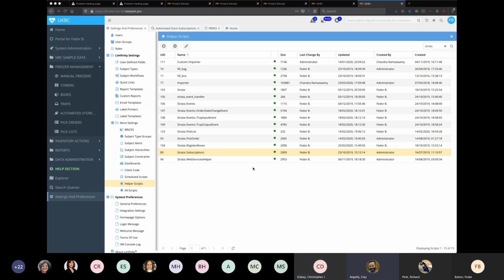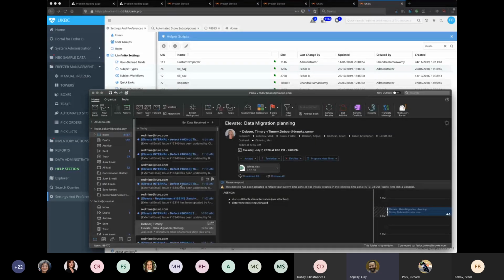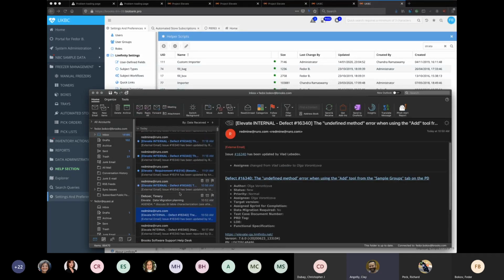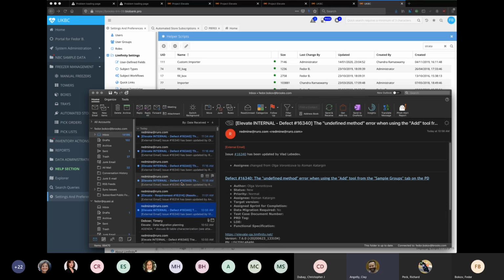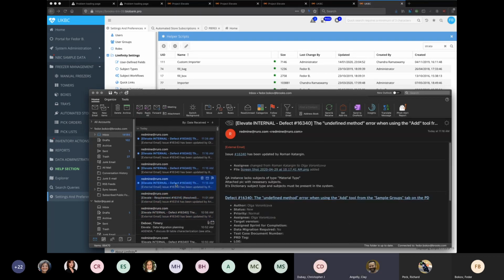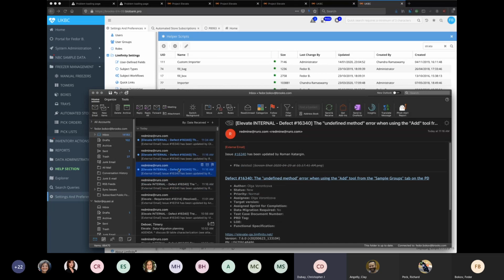Chris, sorry, this is Clay Angeli. A question to your question about whether we have plans to include Limfinity within a store. Could you elaborate a bit on what value you see in that, trying to understand a use case from your perspective? Oh, it was much more of a curiosity type thing, not a specific use case.